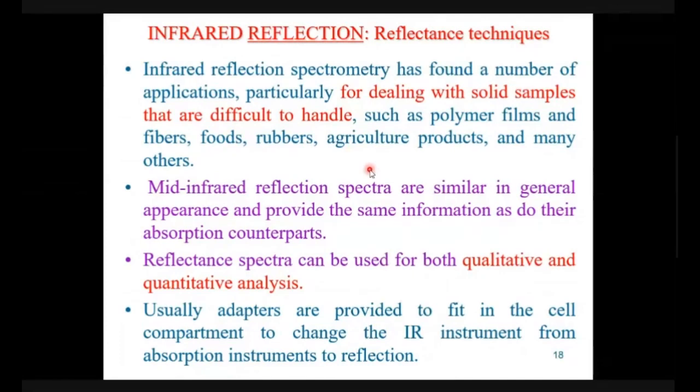Now, every type of the sample mentioned here has own challenge. Like if it is a fiber, how will you prepare pellet of fiber? How will you dissolve the fiber, which is generally a polymer, into a solvent? So the challenge in case of fiber, same with polymer films. Same goes with food. Food has a lot of complex molecule inside it. How can you dissolve all of them? So every type has its own challenges.